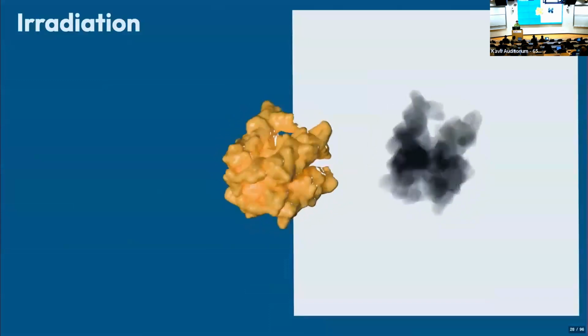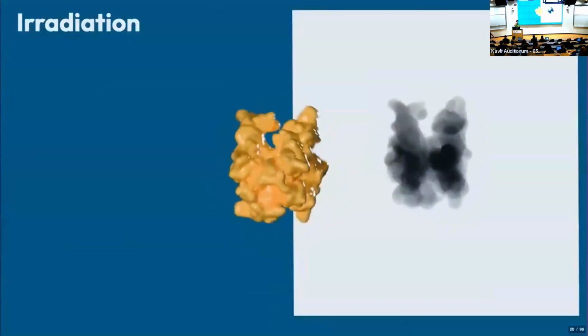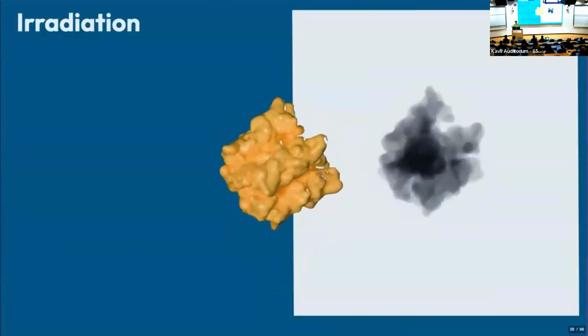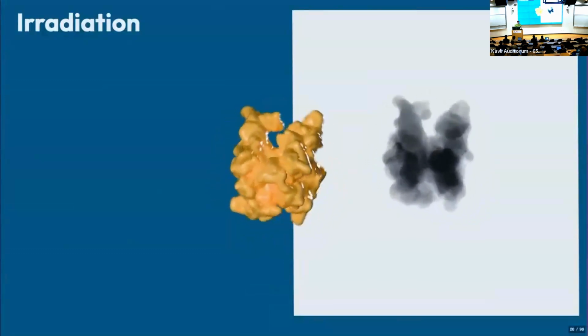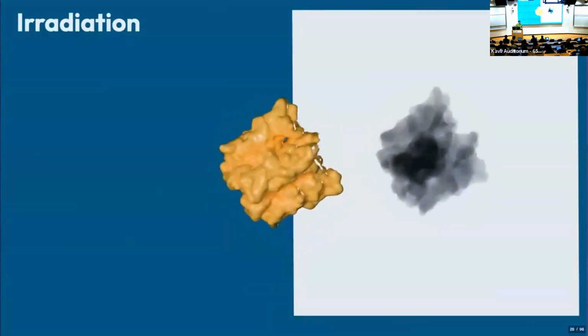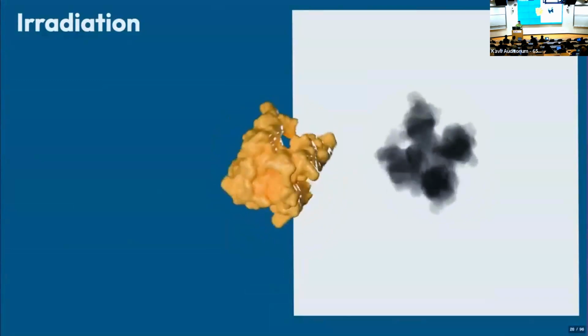One of the things we do to lessen the effect of that irradiation burning away the high resolution information is we collect with low dose. Fewer electrons mean that high resolution information lasts longer than if we were using a ton of electrons.